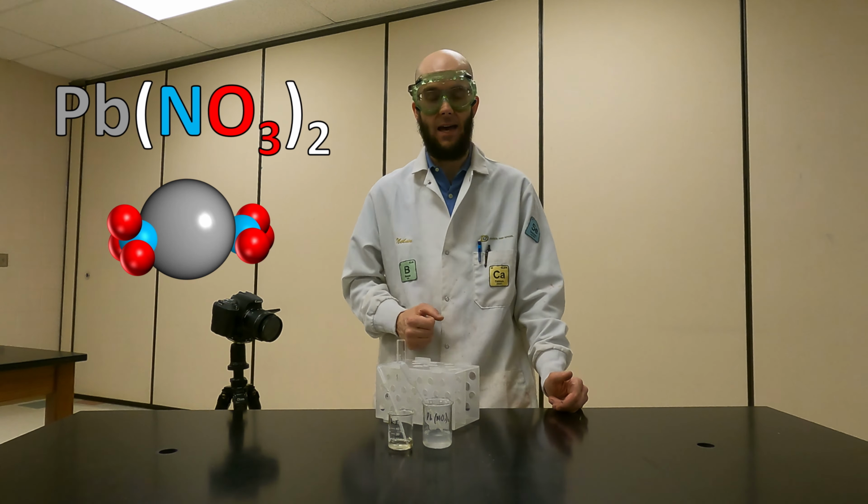Now keeping in mind that this is a double replacement reaction, what products do you think we'll get when this reaction takes place? So let's do this reaction and see what we get. So I'm going to take some of my lead nitrate here, place it in my test tube. Now I'm going to take my potassium iodide and place that in. Let's see what happens. All right, so we see the formation of this beautiful, brilliant yellow precipitate.